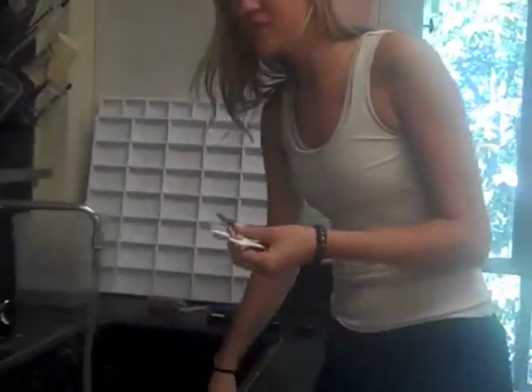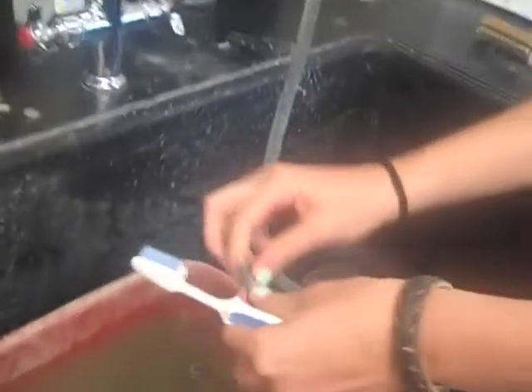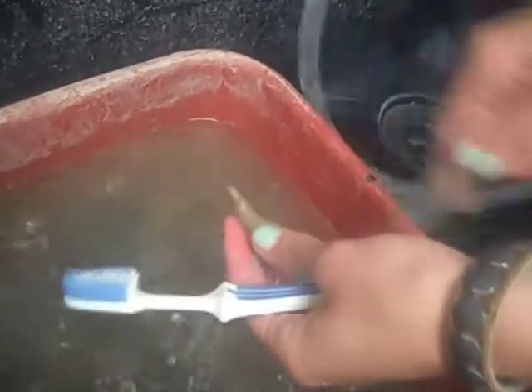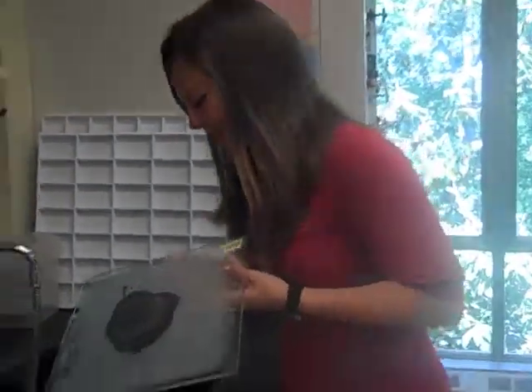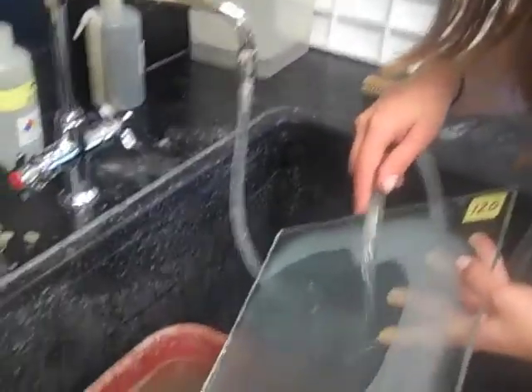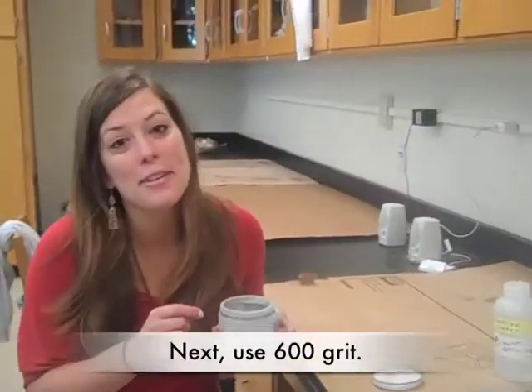It's very important that between each grit you thoroughly scrub off the surface of the bryozoan. It's best to do this in a sink and wash it off into a bucket so that the grit doesn't go down the drain. Rinse the surface using something like a toothbrush or a scrubber brush. Make sure you keep your sample with your box, and clean off your polishing plate by rinsing all the grit into the bucket, wiping it off, and drying it with a towel so it's ready for next time.